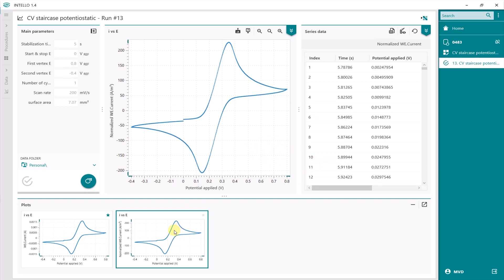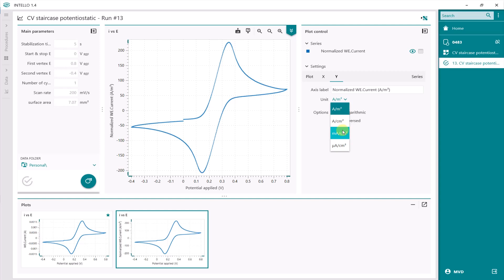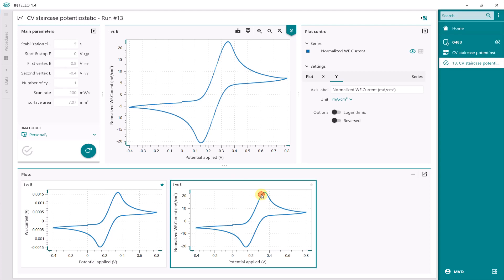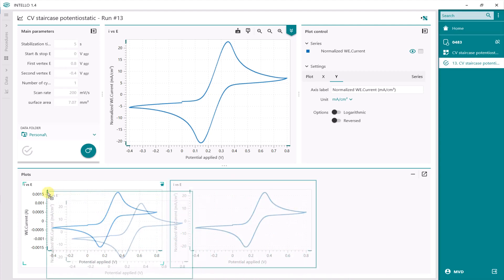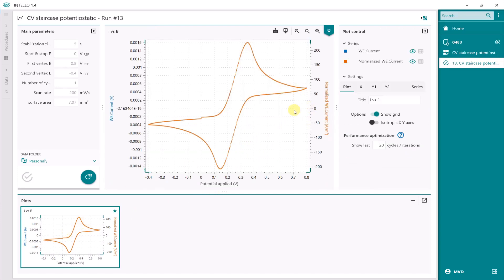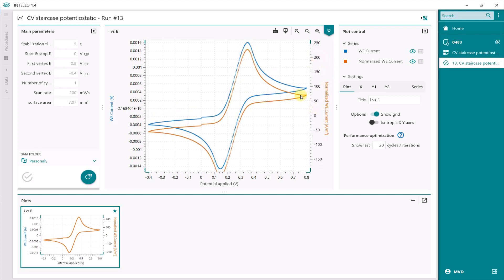You can also change the y-axis to a different unit — for example, milliamps per square centimeter. Then you have it displayed in milliamps per square centimeter. You can also drag and drop plots on top of each other to overlay them. This shows the same data with different y-axes: on the left you have the current, and on the right you have the current density.